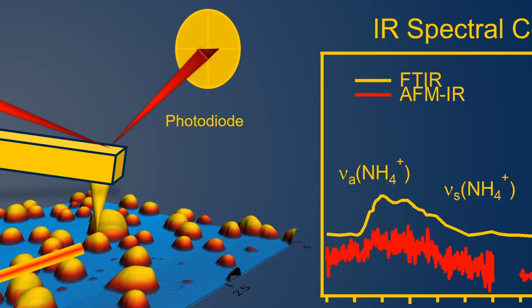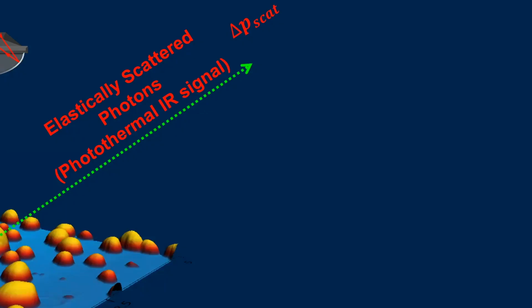But there were a couple of drawbacks. One of the biggest was the fact that when we were working with AFM, we often work with kind of gooey or sticky molecules. And so this was really challenging to do with the tips. And so when we heard there was a contactless option for photothermal infrared, we were really excited about that. And so we published one of the first papers, the first one on atmospheric aerosols, and one of the earlier papers on optical photothermal infrared coupled with Raman spectroscopy. And this was for the submicron analysis of submicron aerosol particles that we've collected, both from the field as well as in the lab. And this was led by Nicole Olson, another graduate student of mine you can see in the upper right corner there.